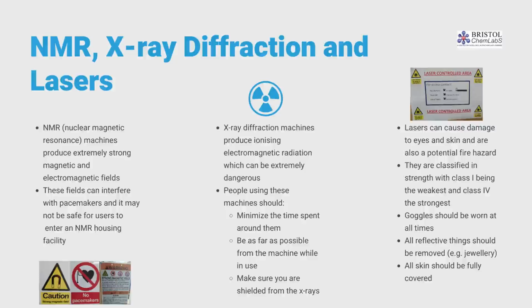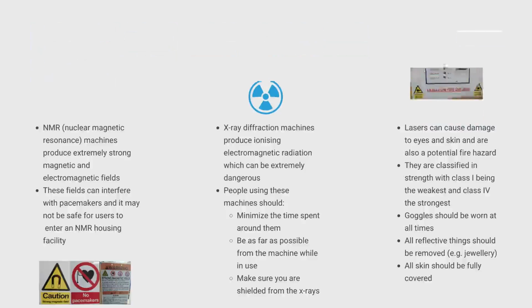Lasers can cause damage to eyes and skin, and are also a potential fire hazard. Goggles should be worn at all times, all reflective things should be removed, for example jewelry, and skin should be fully covered to prevent burns.